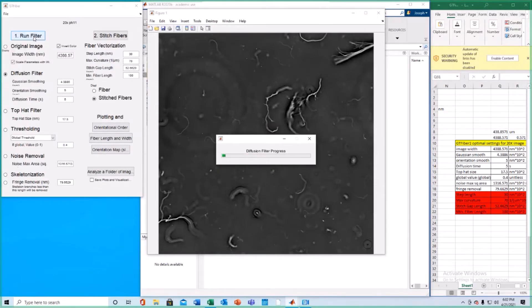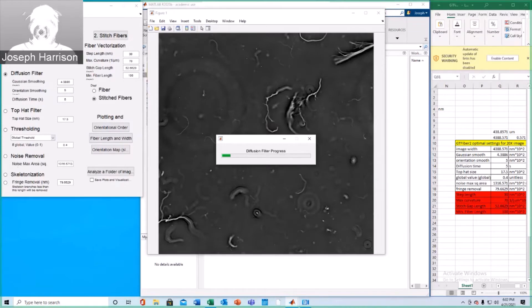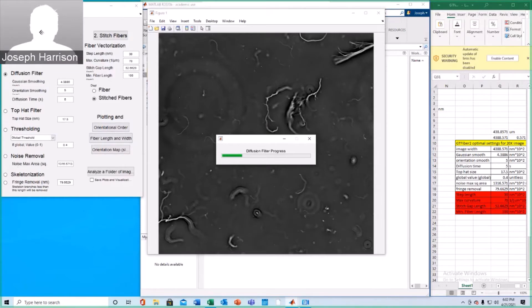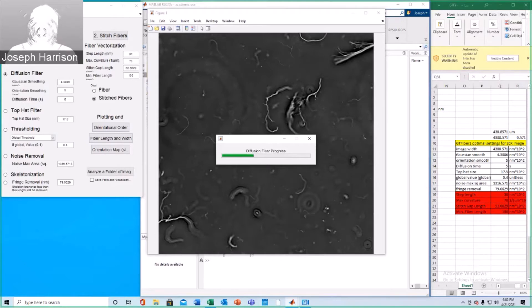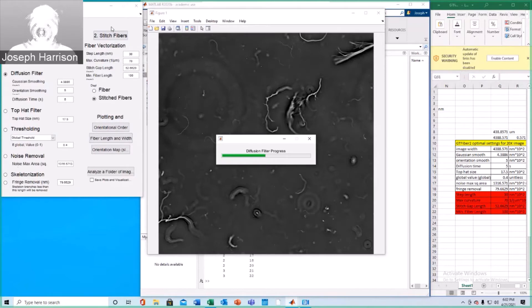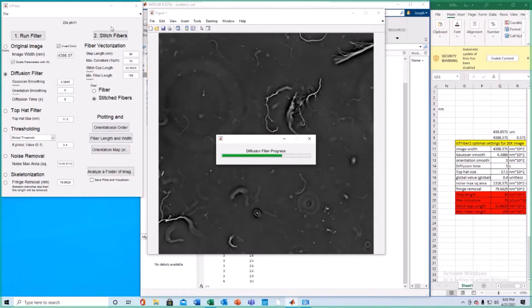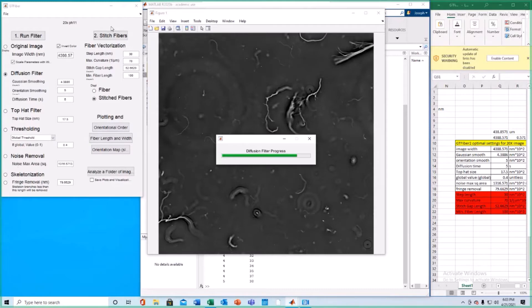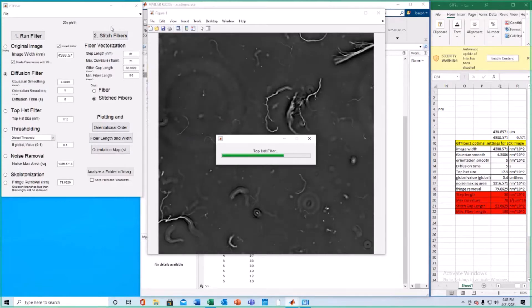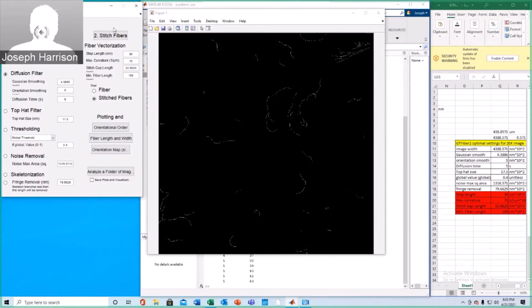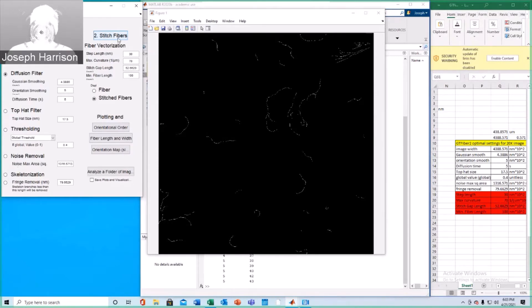It's also important to note that it helps to have a decent computer in this case. These analyses can take a while. The actual first filter that's run through takes a little bit, but the stitching fiber process typically takes much longer. Alright, so that's been filtered. Looks pretty good. We're going to go ahead and stitch these fibers now.